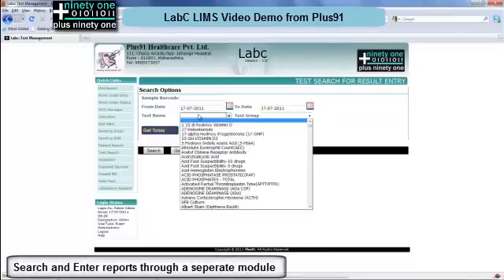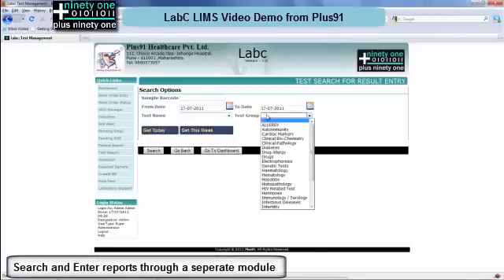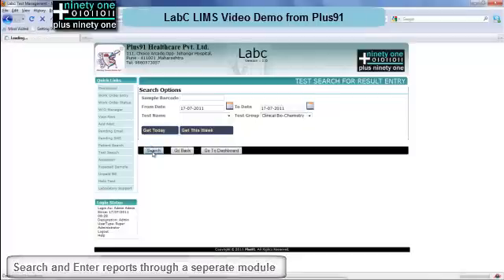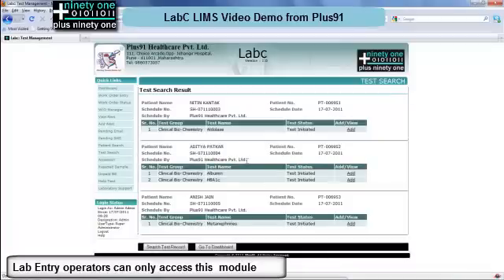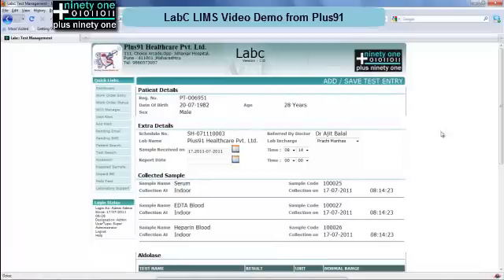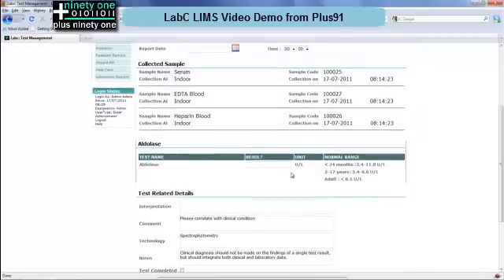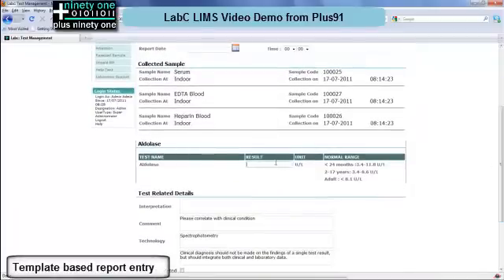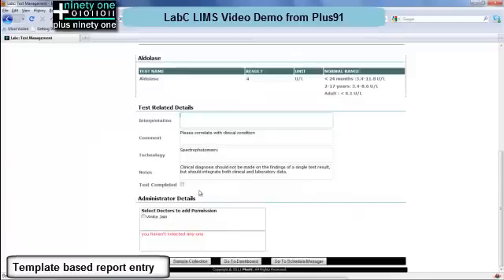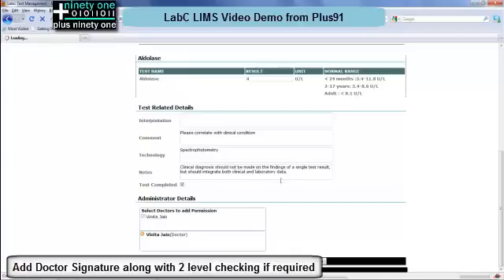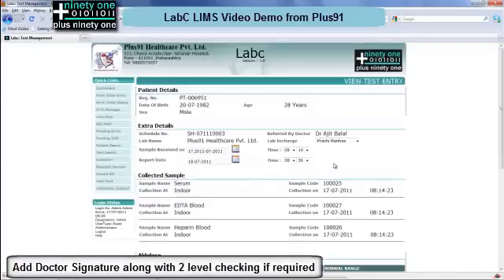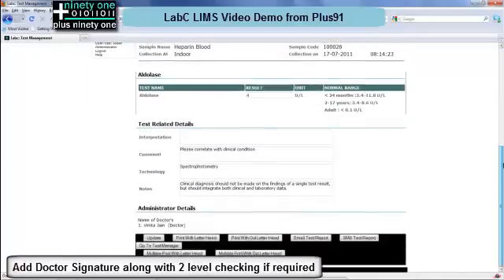Similarly a reports module is present where you can search for a bunch of reports for a given day, a given group, etc. Once you click on search it will show you all the lists of the tests. Click on the add button, enter the test parameters, and you can go to the next test directly or go back. You have a template-based report entry system in LabC. Here you can enter the values as a result and it also has a reference range built in. If a value is outside the reference range, you can get a pop-up or alert.